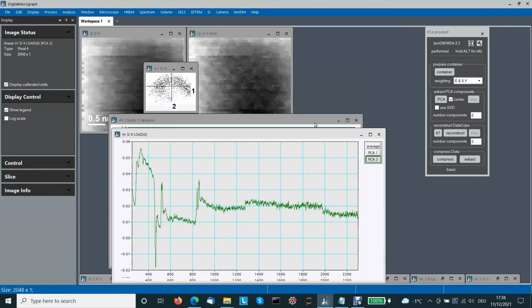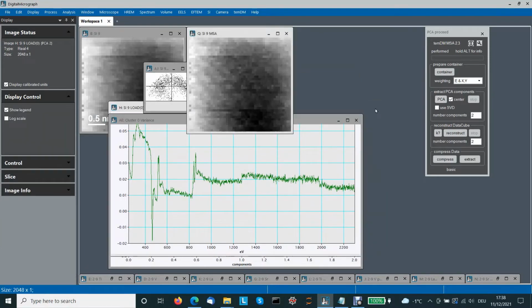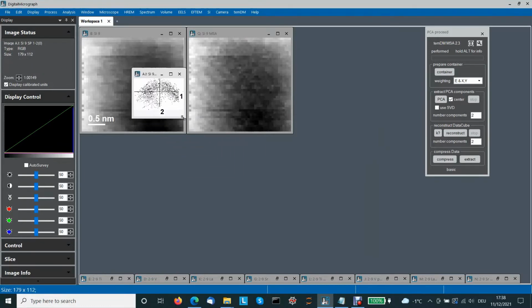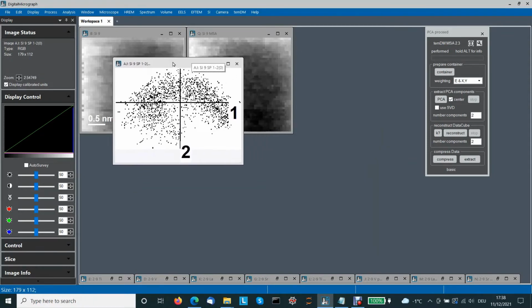The good thing is that all this data are already saved in the container. So just close everything without saving. Don't care much about storing the MSA data. This is quite an interesting plot.